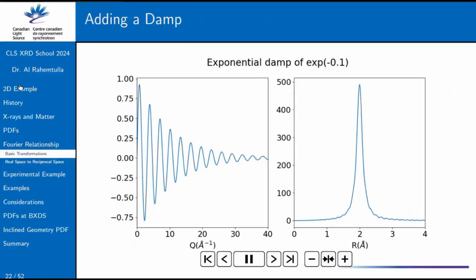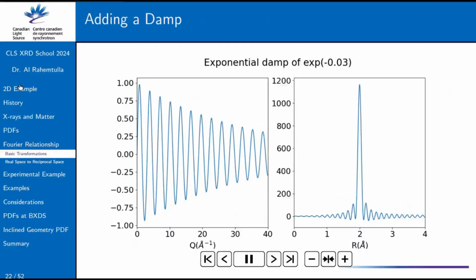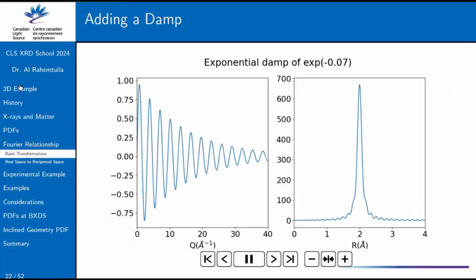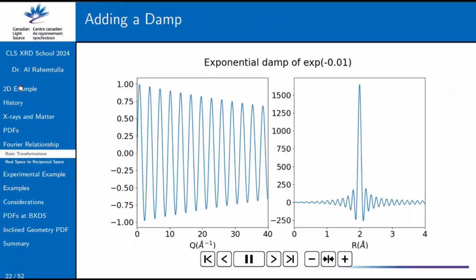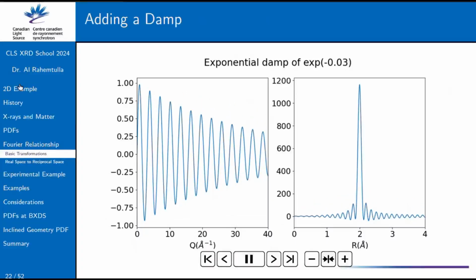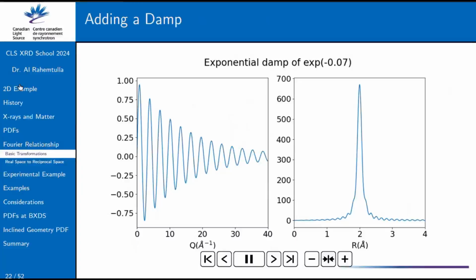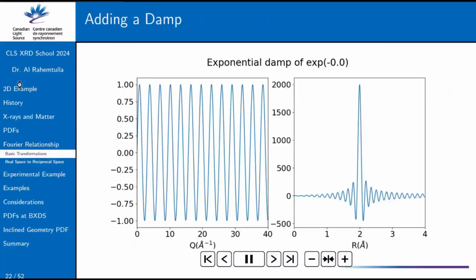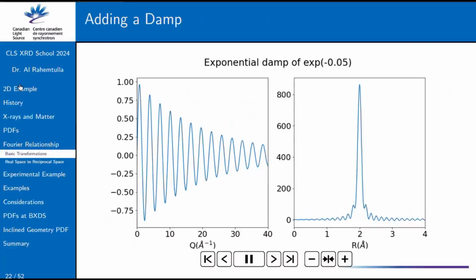So often, especially with these tilted geometry measurements where we go to high Q, we'll usually use our cold finger and reduce the temperature down to 80 Kelvin, because when you reduce that thermal noise, the long range atomic ordering gets sharper and sharper. Those nearest neighbor distances are going to coalesce tighter together, so you can pull out sharper peaks because it doesn't have thermal noise in it.